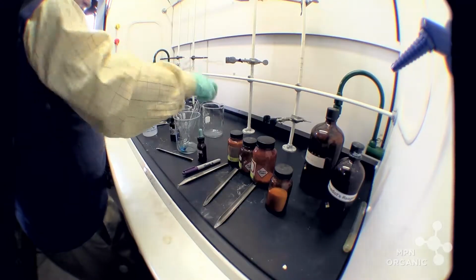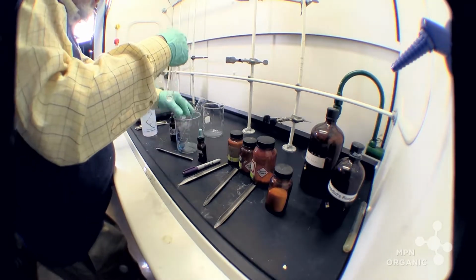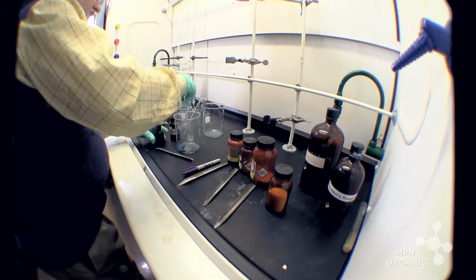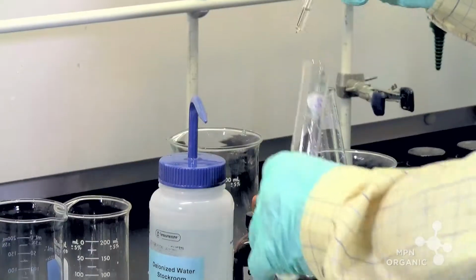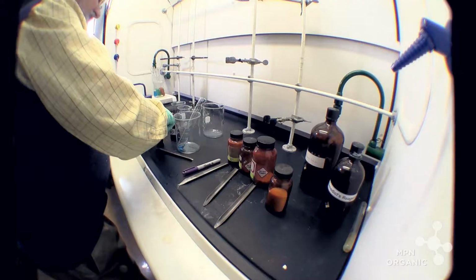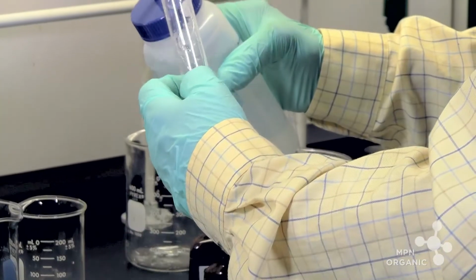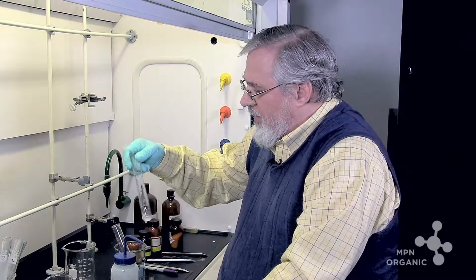Now, to the sucrose in this test tube, I'm going to put a couple drops of concentrated sulfuric acid. Make sure you wear your gloves when you handle this. Put that in there. Cap that up again. Dilute that down a little bit.